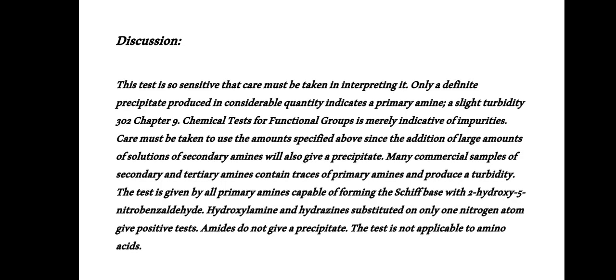A small discussion about this procedure and test is that this test is very sensitive and must be taken into consideration when interpreting it, as only a definite precipitate produced in considerable quantity indicates a primary amine, and as said, a slight turbidity would not indicate a positive test, but might be indicating impurities, because many commercial samples of secondary and tertiary amines contain traces of primary amines and will also produce a turbidity.